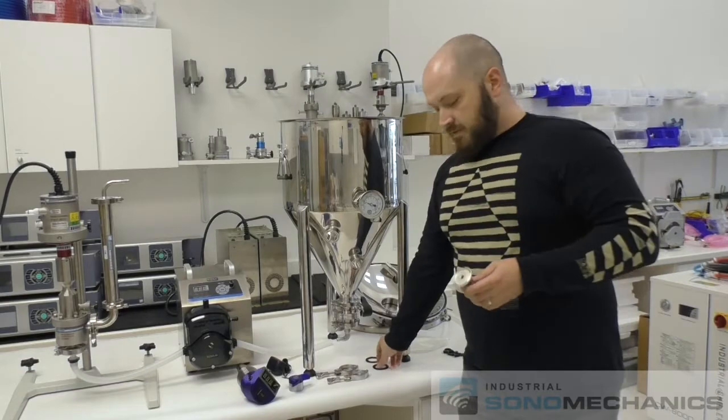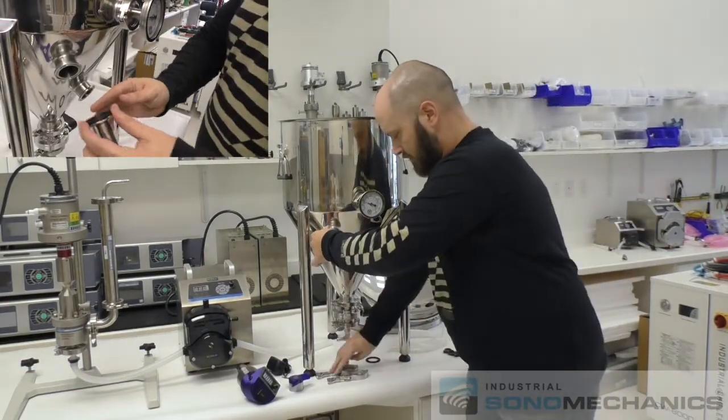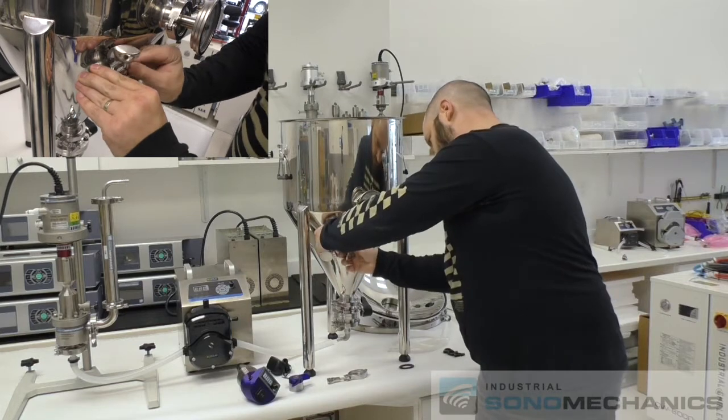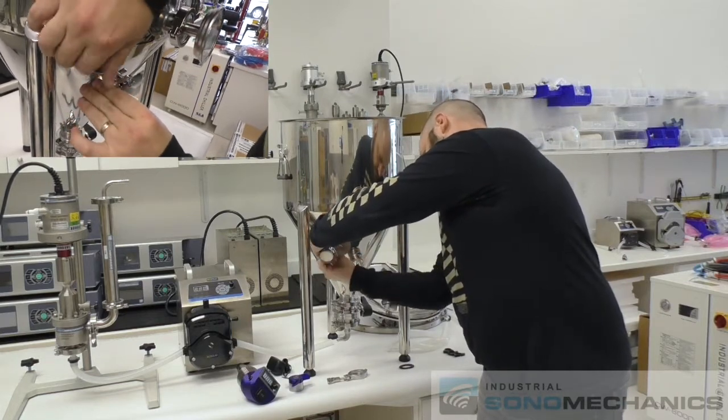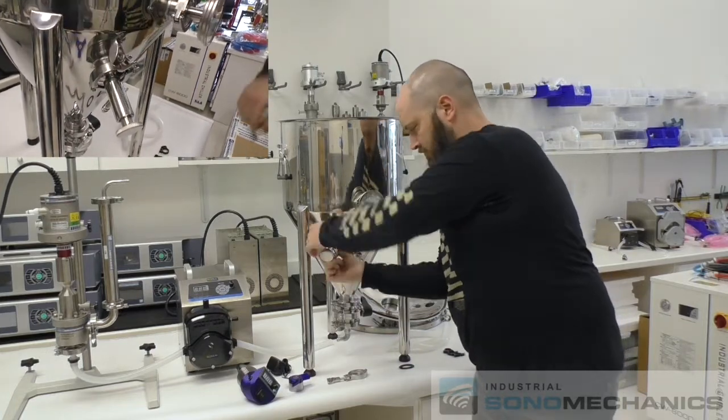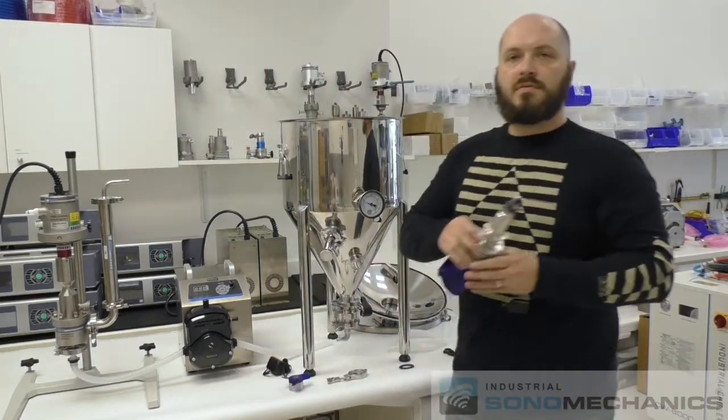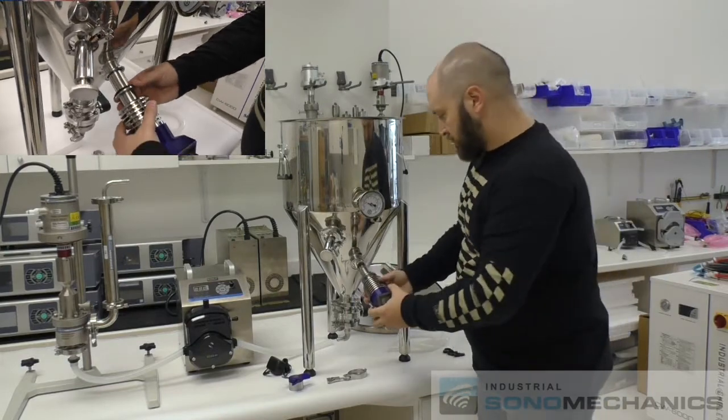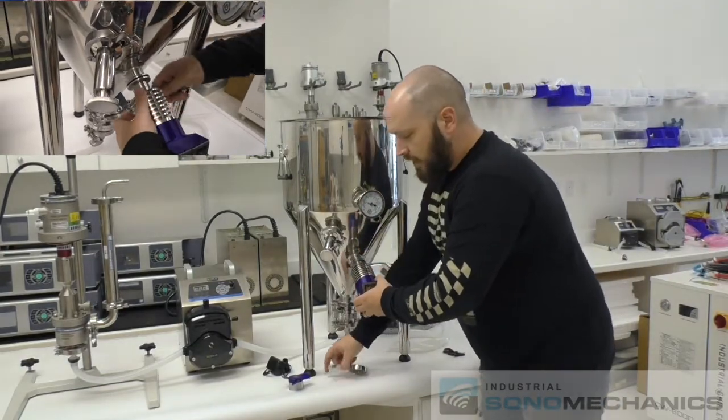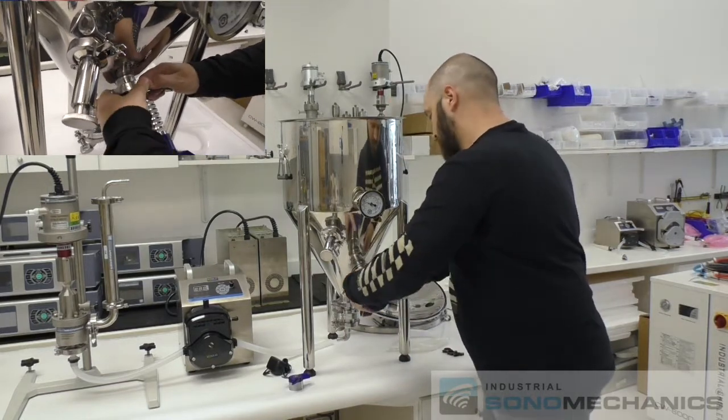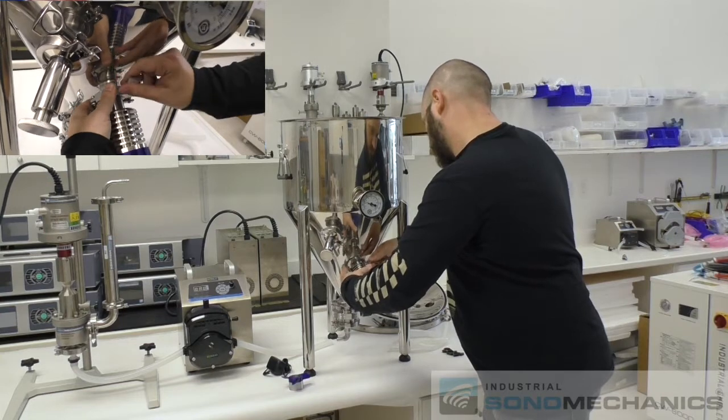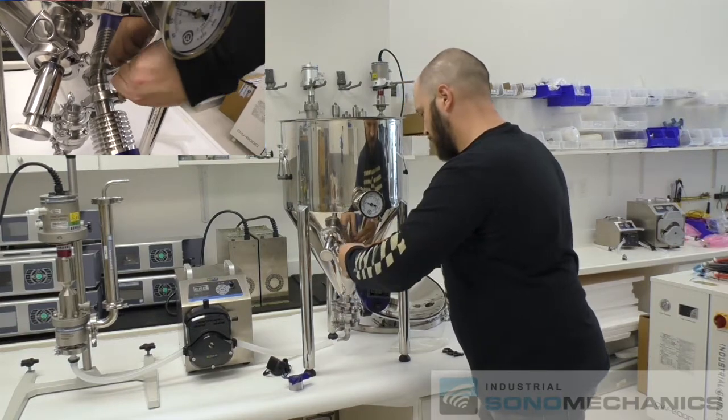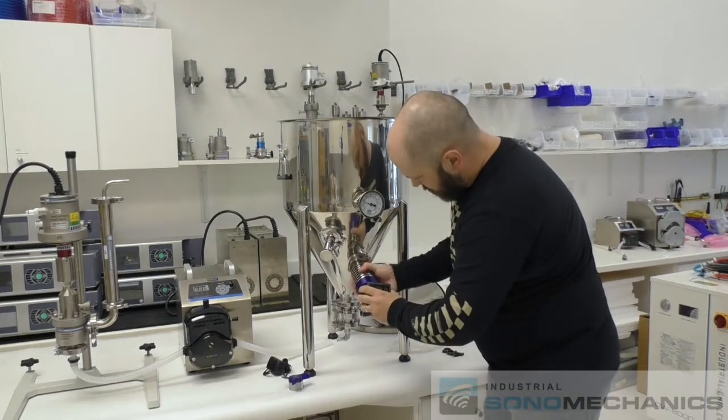Then we have the sampling valve, again with a gasket, valve clamp, then we have the mixer body, again with a sanitary gasket, we insert it, and for this part you might want to have someone holding the mixer for you. We'll line it up.